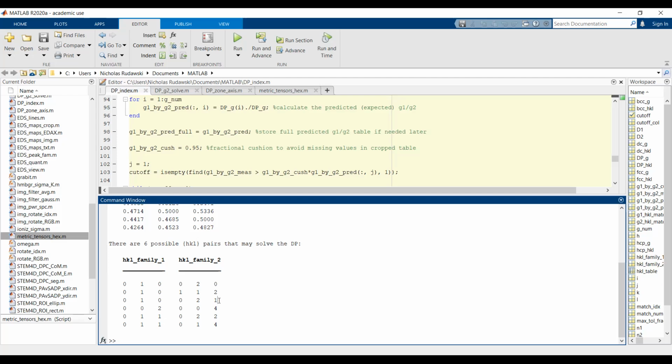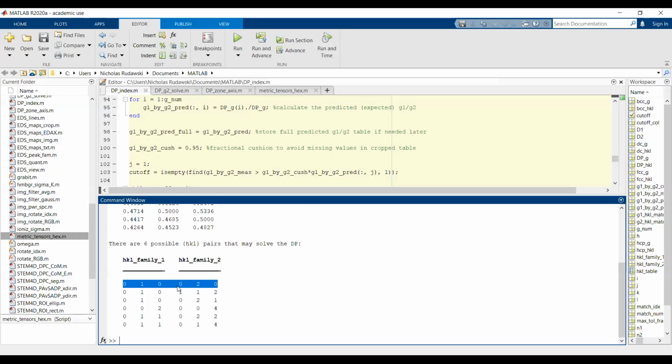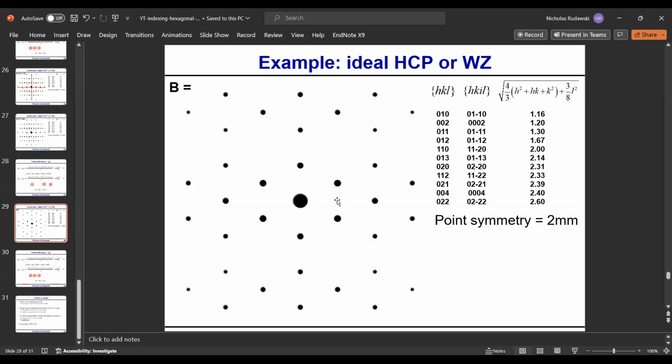All right. So that leaves us with 3 here. Okay. This is also a linear multiple of this. So that can't work either, right? So again, linear multiple would imply, right? So let's just say that this was the solution. We would be seeing another spot here, okay? Because this is twice the length of this, right?